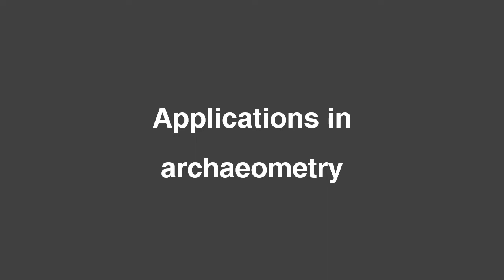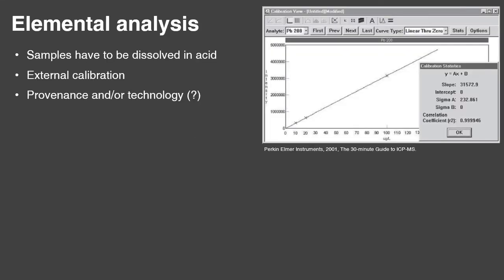units. For liquid elemental analysis of, for example, metal objects, the samples first have to be dissolved in acid, evaporated, and then taken up in weakly concentrated acid for analysis. With suitable dilutions, major to trace and even ultra trace levels can be determined. Quantification is done by external calibration.